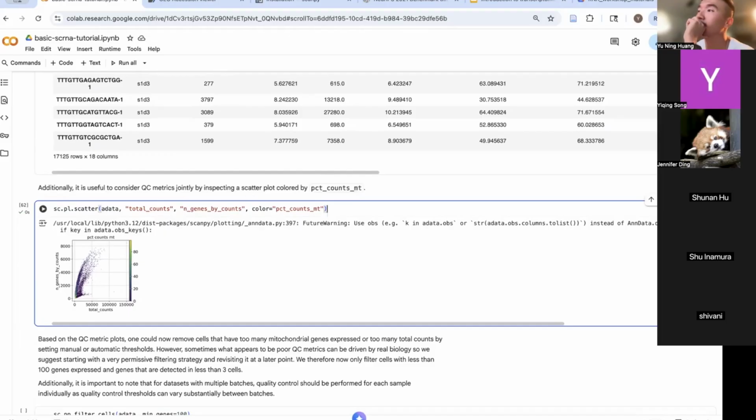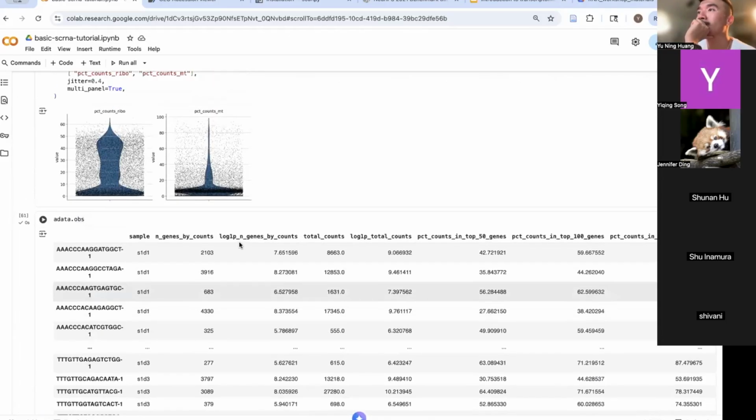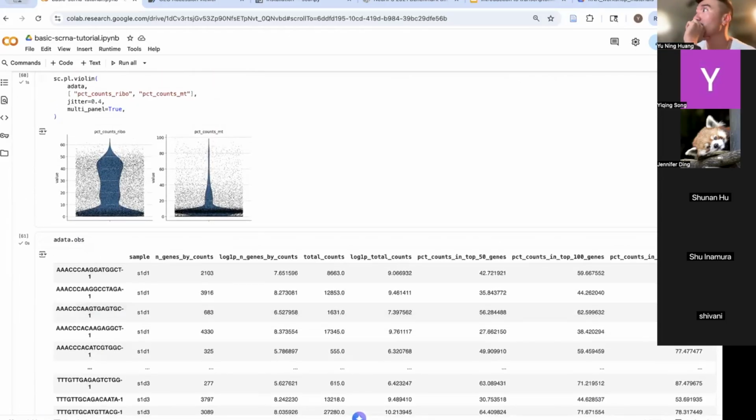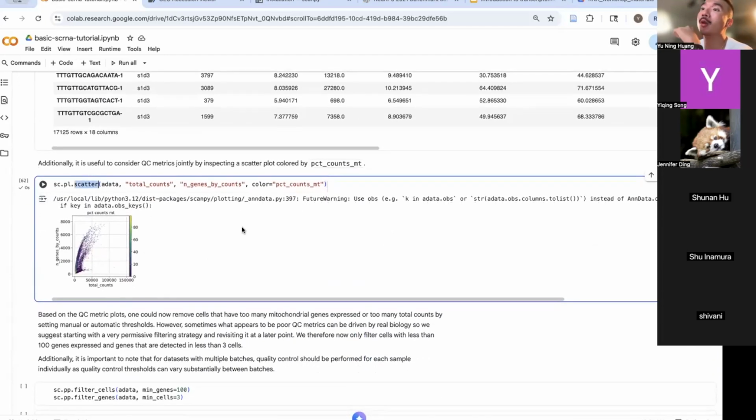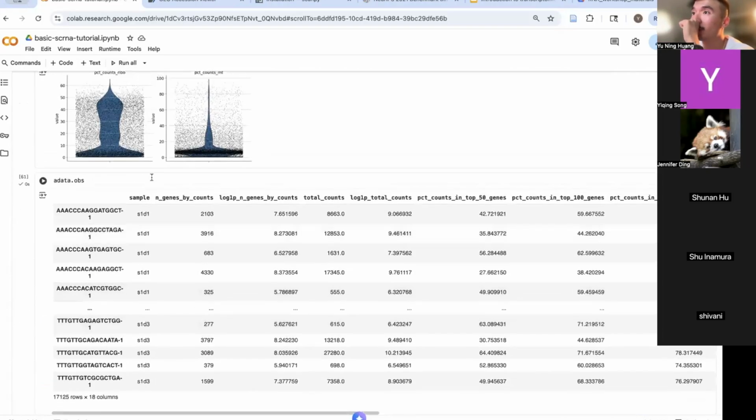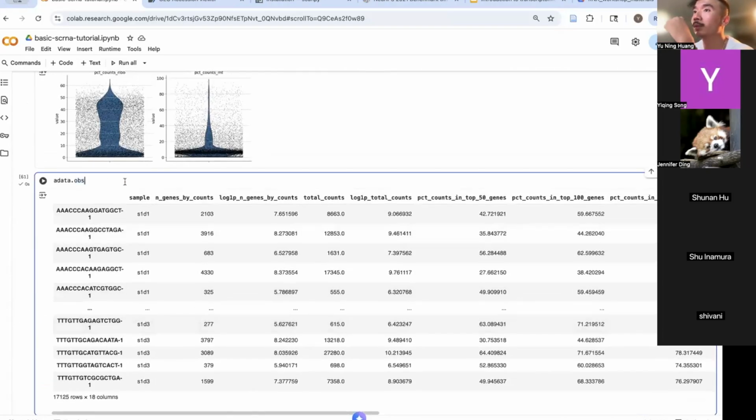I had a question about the previous plot. Yeah. Is it also a violin and scatter plot? What do all the points on the plot suggest? The one above this? This one, right? No, no, the one above that. This one. Yeah, this one. No, I mean this one.